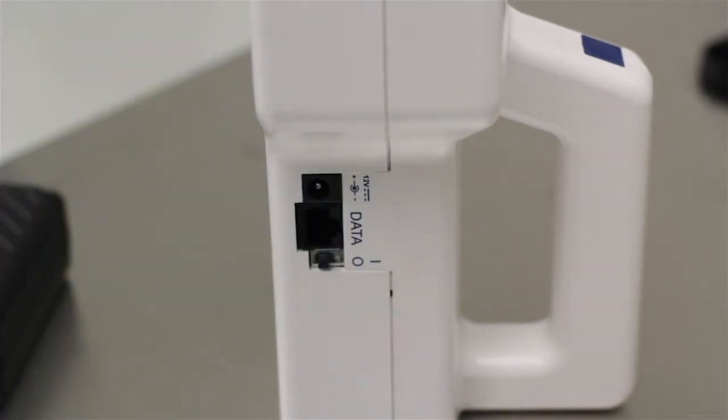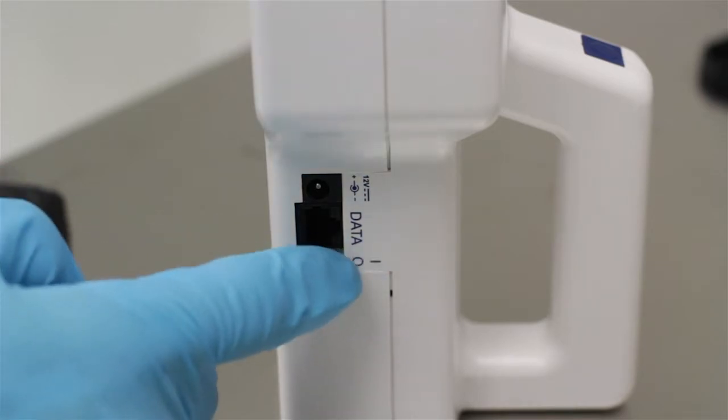Once you have power, simply use the on-off switch on the left side and you're powered up.